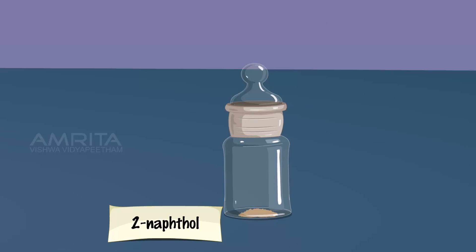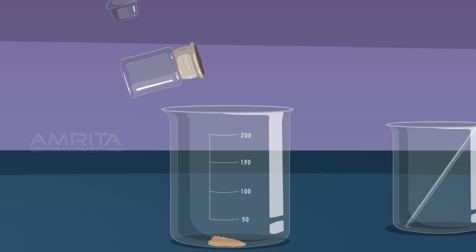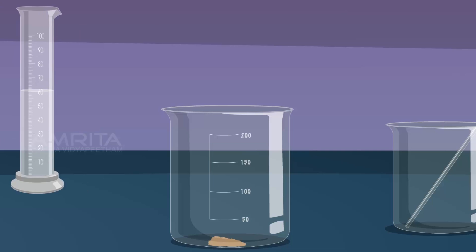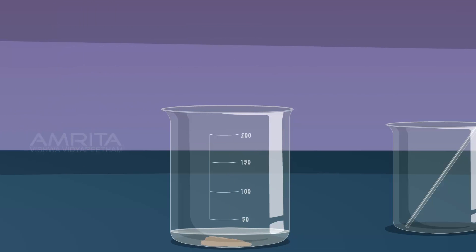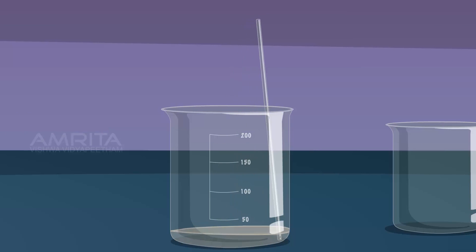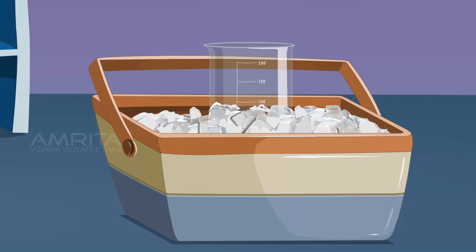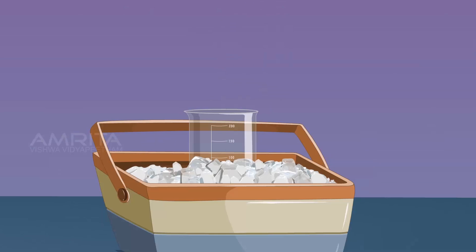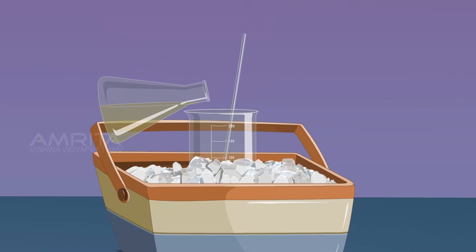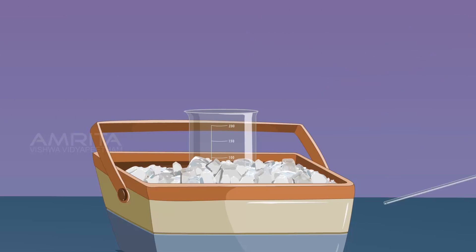Take 7 grams of 2-naphthol and transfer it into a beaker. Add 60 ml of 10% sodium hydroxide solution into it. Stir the contents of the beaker using a glass rod to dissolve the solid. Cool the solution to 5 degrees Celsius by placing the beaker in an ice bath. Take the conical flask from the water, then add the solution in the conical flask to the 2-naphthol solution while stirring constantly using a glass rod.